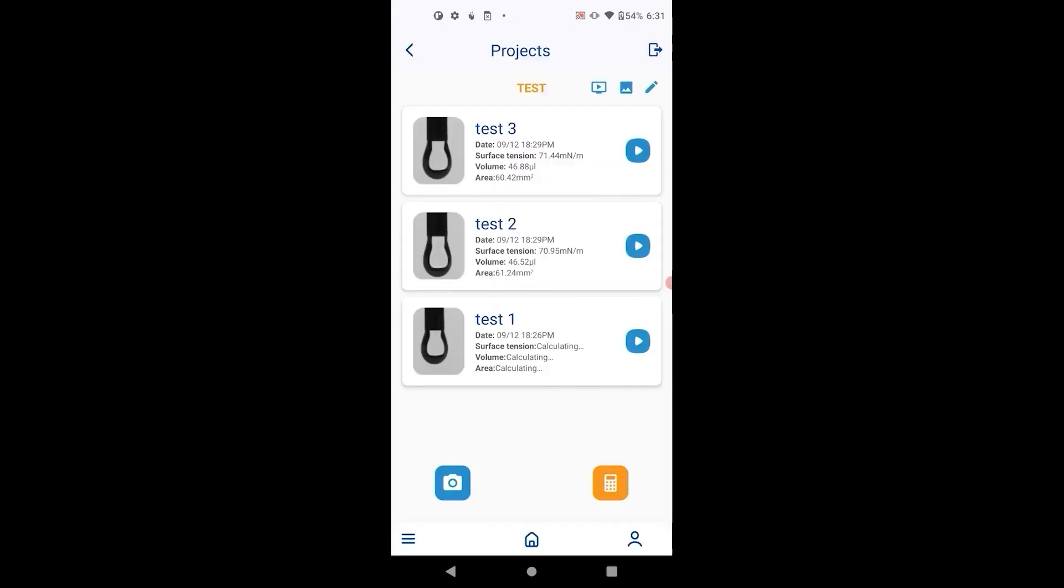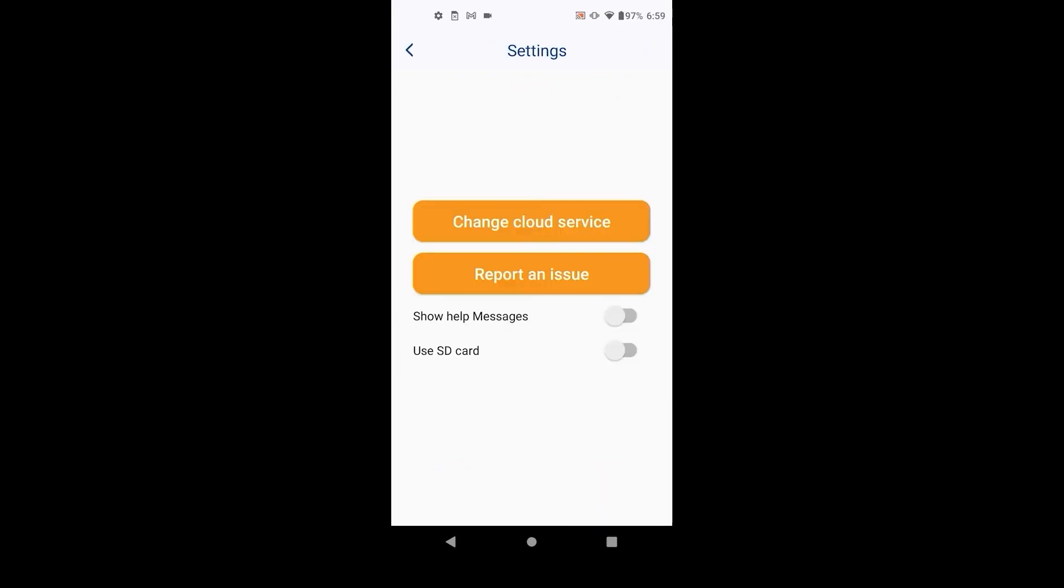The calculated data can be saved per your preference in settings. You can choose if you want to store the data on the SD card. You can also choose to save on your preferred cloud service. We currently support Google Drive, Dropbox, Microsoft OneDrive and Box.